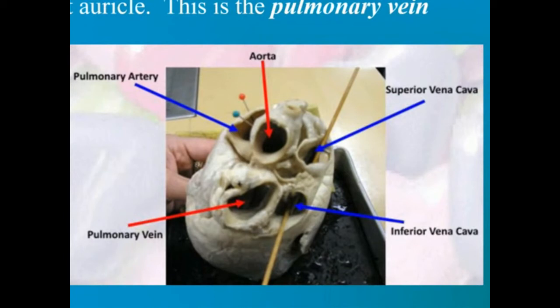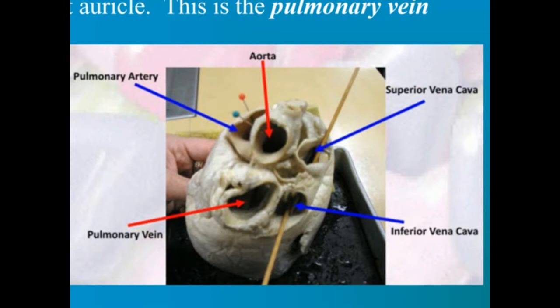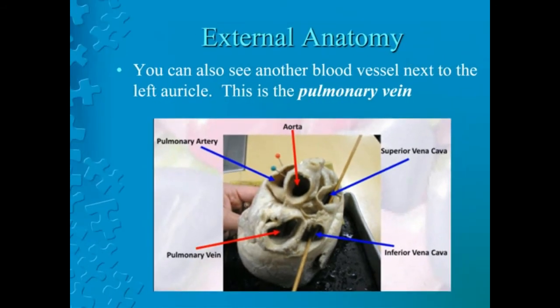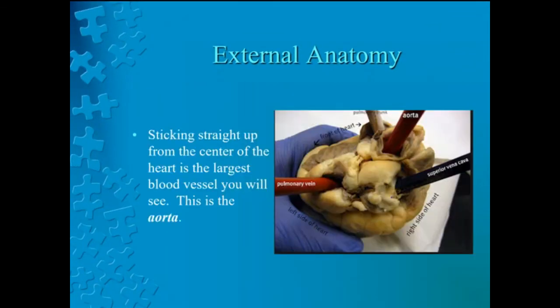The aorta takes oxygenated blood from the left ventricle to the rest of the body. There is a right and left ventricle, referred to collectively as ventricles — the lower chambers of the heart. The aorta branches into more than one artery right after it leaves the heart, so it may have more than one opening on your heart specimen. Look carefully at the openings and you should be able to see that they are connected to each other. Pause to locate the aorta.